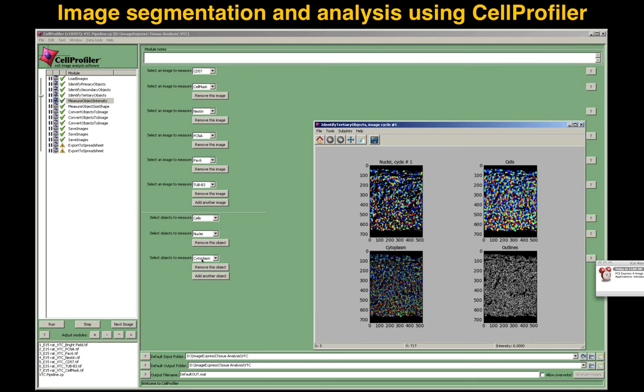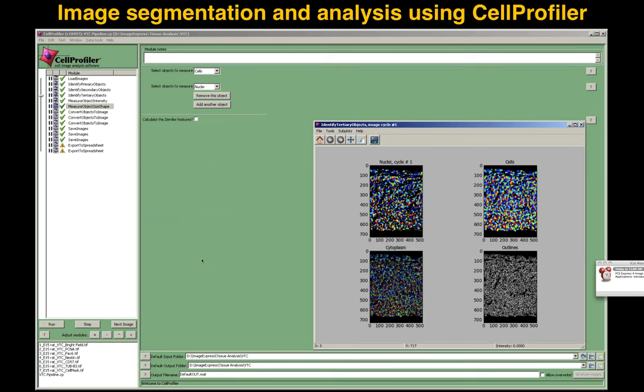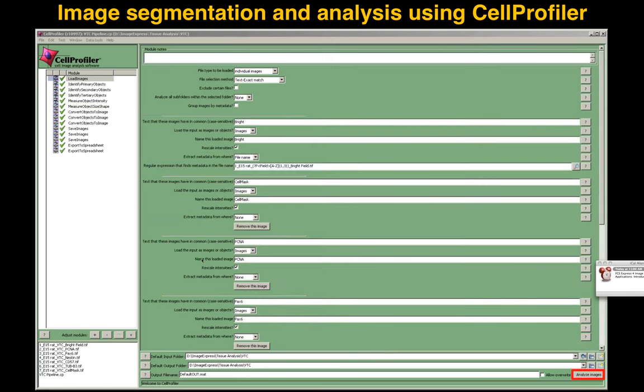These will be very useful if you're looking at trafficking of molecules from one compartment to the other. Nuclear translocation comes to mind, or many other different. Or if you want to look at if the compartmentalization is really nuclear versus membrane, and so forth.